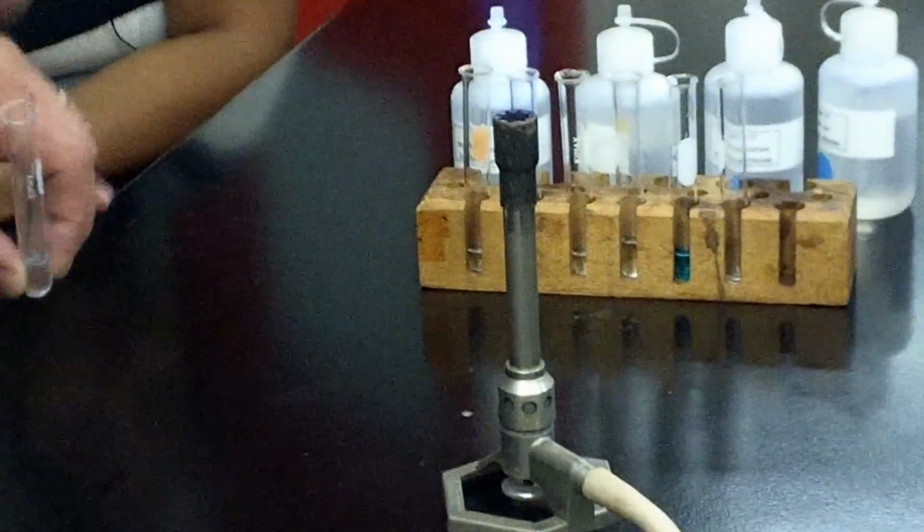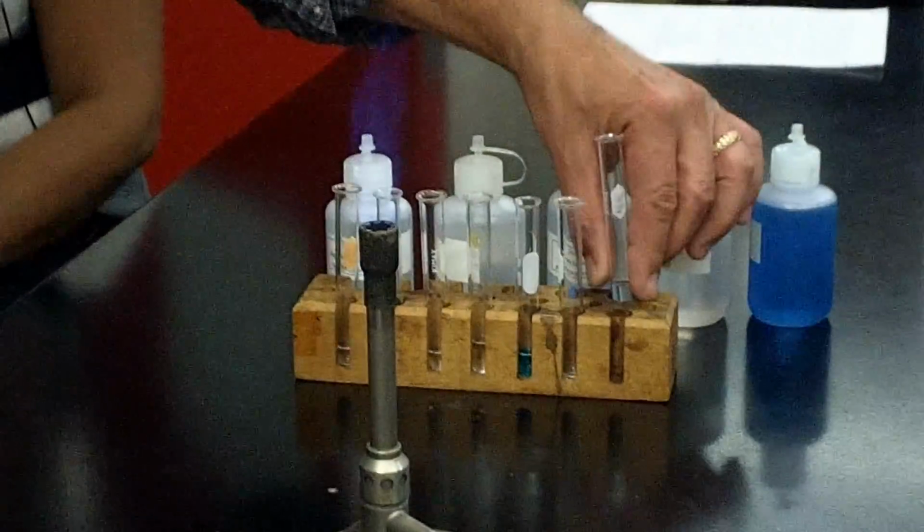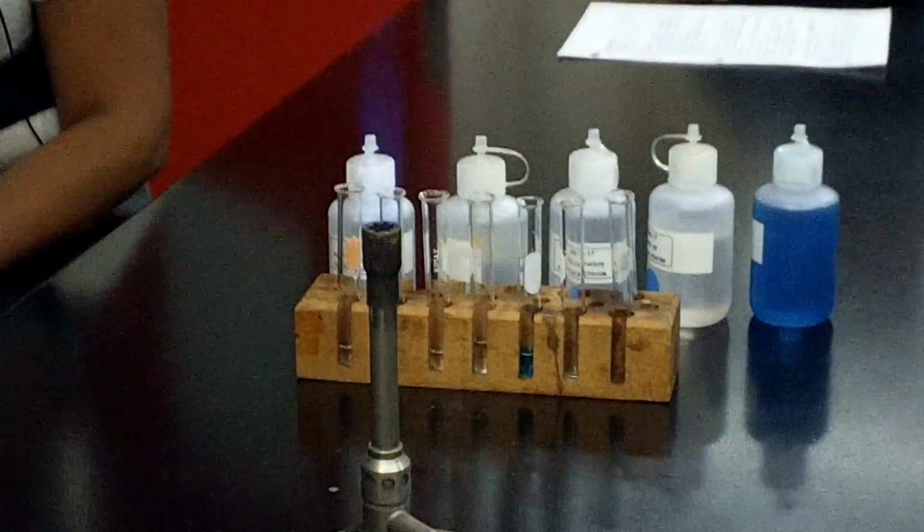You guys know how to blow bubbles when we were kids? I've captured a little drop in the hole. You see a little drop of the chemical in the hole? Alright? So when your kids used to blow the bubbles, we're not going to do that, we're going to heat it up. And I should see that it'll evaporate and a color will come off. So a tiny color came off, and that's because it's got contamination. So we don't see any color this time. Okay? So it's clean.